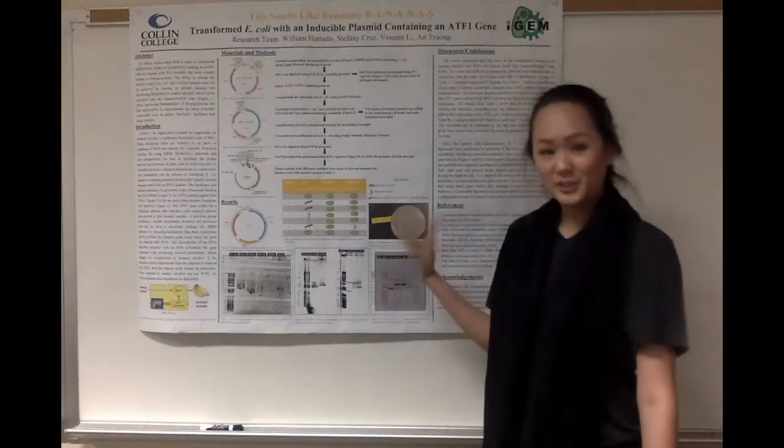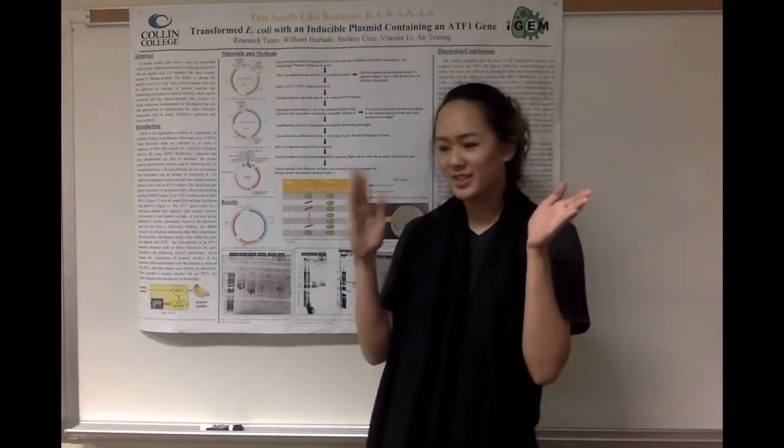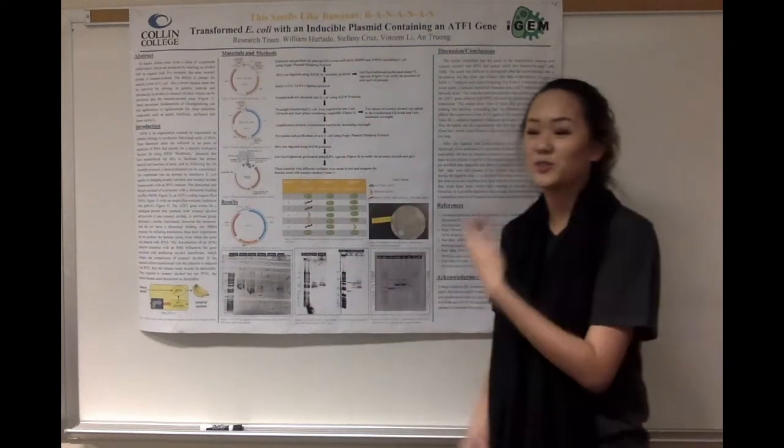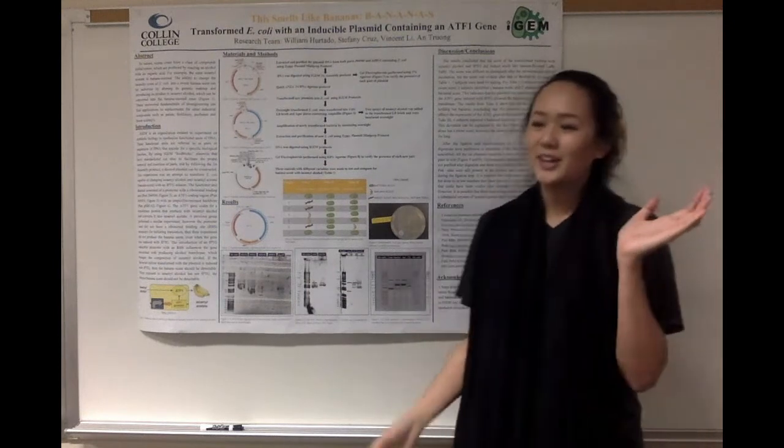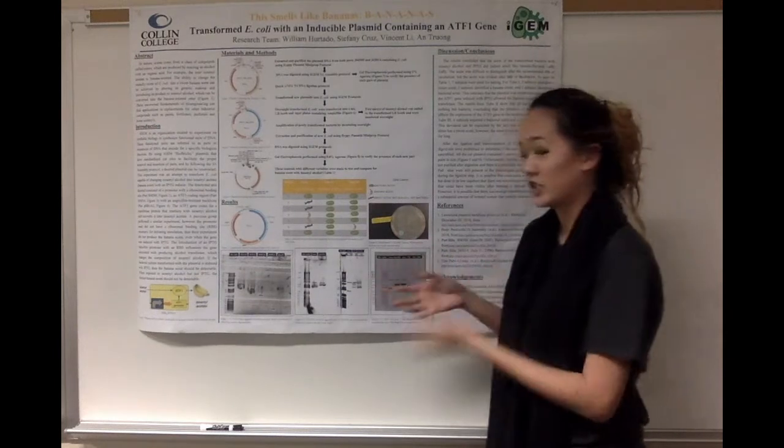After cutting the pieces of DNA, we wanted to make sure that the restriction enzymes cut at the right places. In order to do so, we used electrophoresis on a small sample to run a gel that actually tells us the sizes of each of the digested pieces.